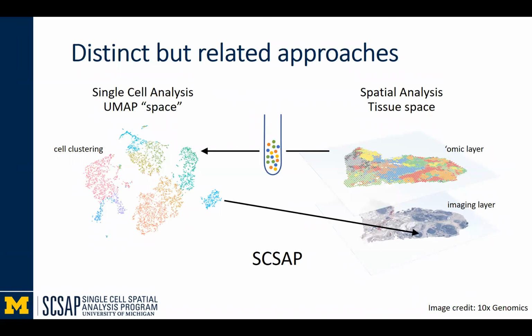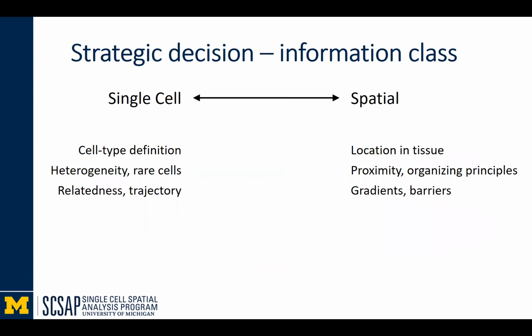So to start out, we need to understand that, through what Evan was describing, single cell and spatial analysis is not just one technique. We're interested in the program in the integration from tissues that would give rise to dispersed cells that are analyzed in particular single cell ways, but also then being able to project those cells back into the tissues. So it's maybe one conceptual idea in its whole, but it's implemented as different steps and technologies.